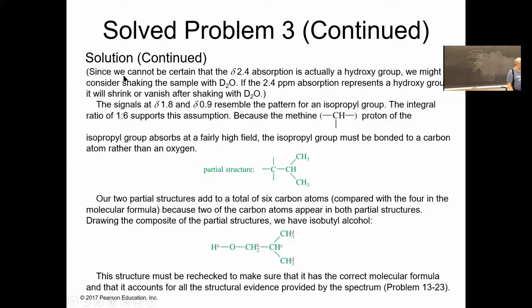Okay, since we cannot be certain that the delta 2.4 absorption is actually a hydroxyl group, we might consider shaking the sample with deuterium oxide or heavy water.